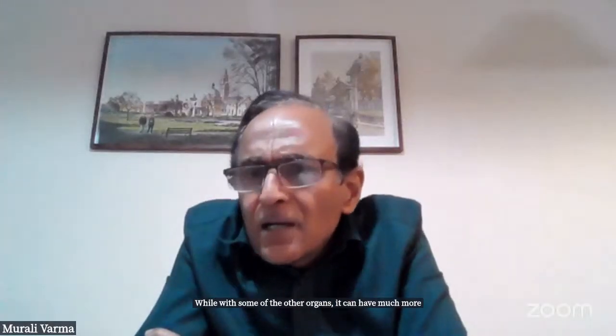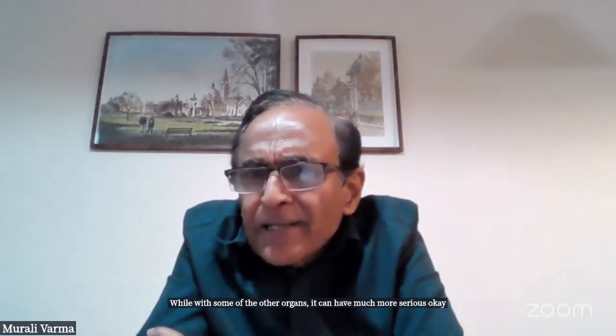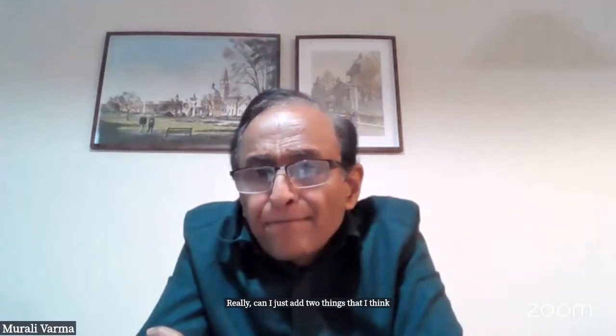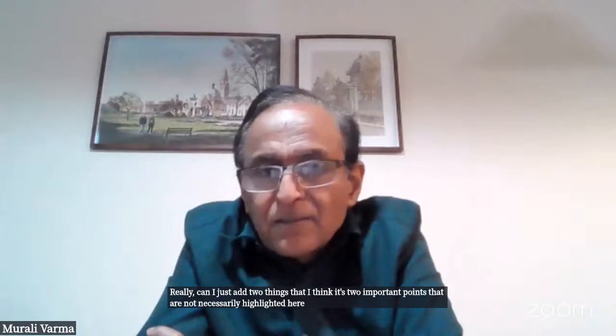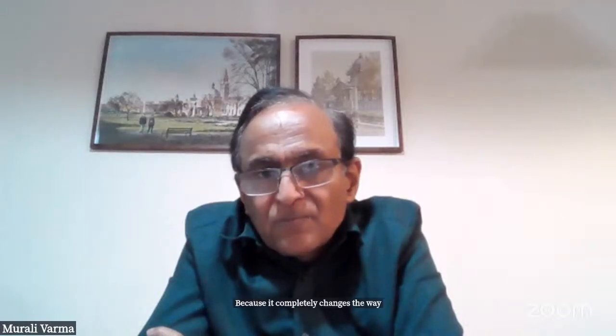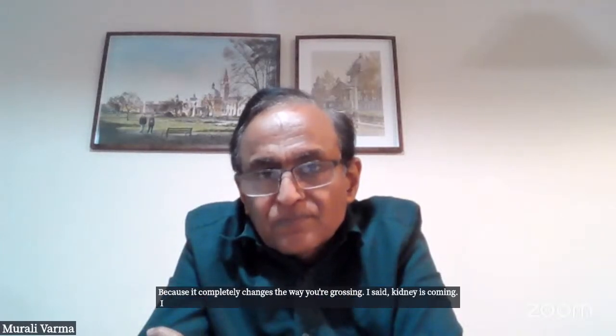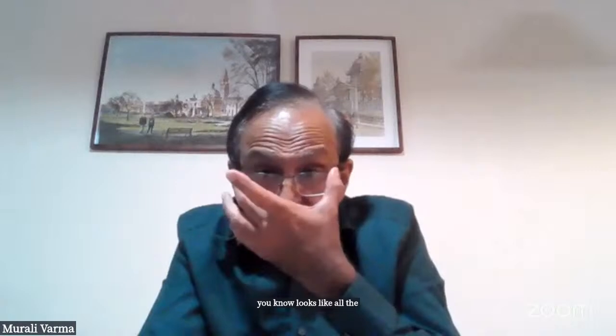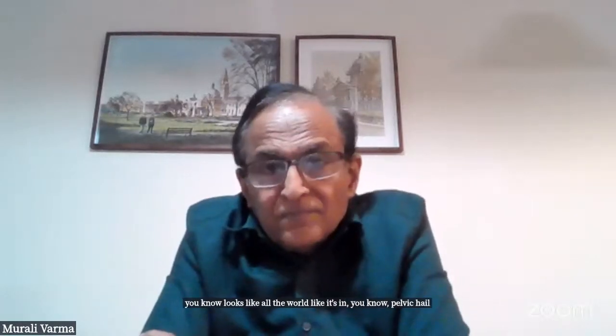Let me see whether there is anything else. Can I just add two important points that are not necessarily highlighted here? If you're not seeing it, you're going to see it: neoadjuvant therapy, because it completely changes the way you're grossing. I said kidney is coming. You may see something that looks for all the world like it's in the pelvicalyceal system or elsewhere, and you sample it, and it's all fibrosis.